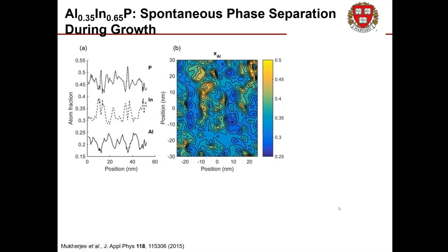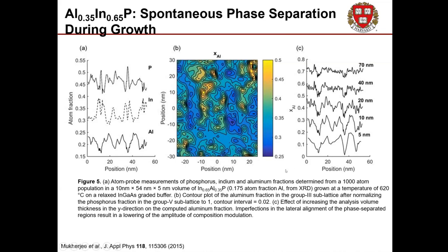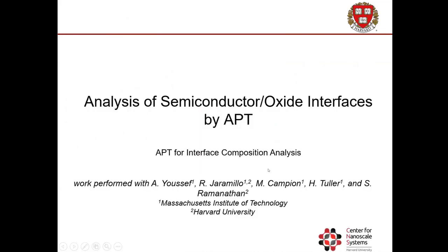Just a complete thought experiment of comparing this to TEM, by the way: if we take this slice of ours and we thicken it from 5 nanometers all the way up to 70, comparable to that TEM lamella that was originally analyzed, we see that the fluctuations begin to average out until they approach those seen in dark field STEM. Okay, so that's some bulk and grain boundary analysis.